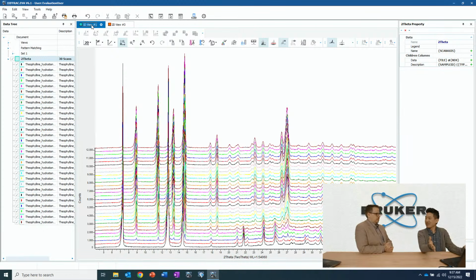If we come back to the fingerprints on a glass analogy, if you have a bunch of fingerprints and you don't know who it is, but you don't really care who it is, you just want to know how many times that person touched the glass, that's what we're doing here. We're looking at the patterns themselves without any information about crystallography or which phase it is, or doing the identification.